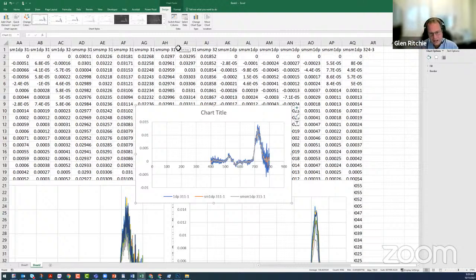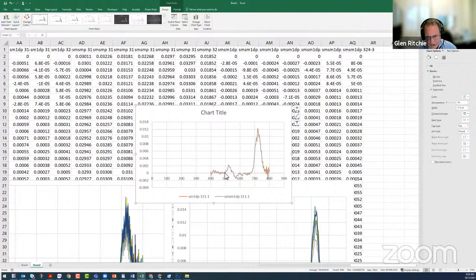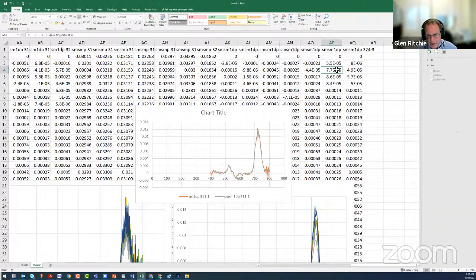So what you can see is that our two smoothed ones follow the same general pattern for the first derivative as our noisy data, but they don't have all the noise here. If I delete the noisy data, you see that these are nice and clean. They still have some peaks and dips, but you have to be careful. If you go super smoothed on it, you can completely flatten everything out and it disappears in this case.